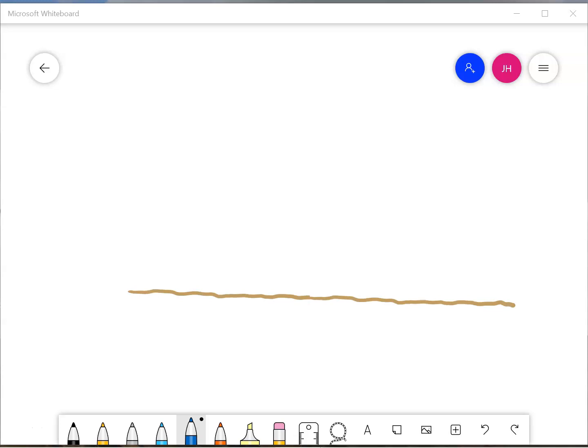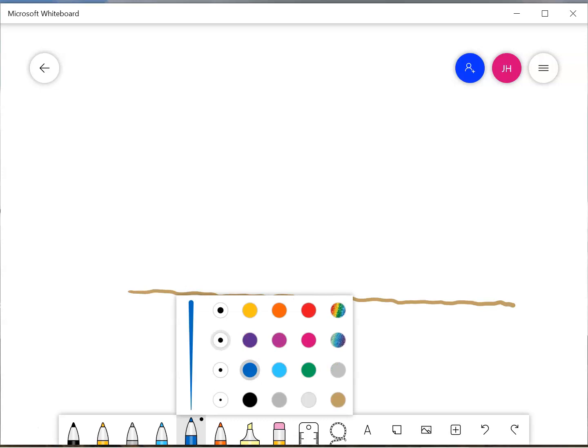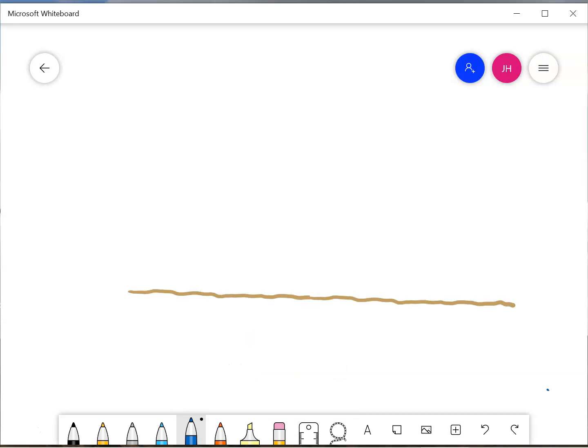they are. So what I have here, this slanted line is supposed to represent the surface of an agar plate, the surface of the agar in a petri dish. So this is where we would put a cell if we were putting a cell on it to see if it formed a colony. So just imagine, let's be blue. So a little cell falls on the surface of this agar and it sticks because it's tiny, it sticks to everything. So, okay, cool.